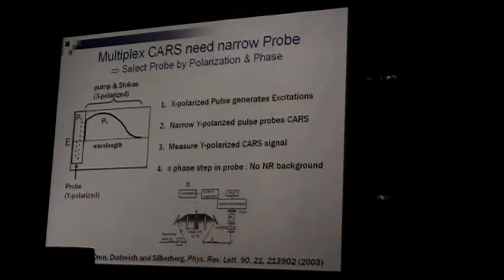So they just said, okay, this is their configuration, just like what I have. They said, okay, command this SLM, this liquid crystal: from here to here, let's set the polarization X. Then, in this narrow part, which is an exaggeration, actually this part is only like 1 nanometer, they said, okay, Y polarization. And you can only do this by pulse shaping, right?